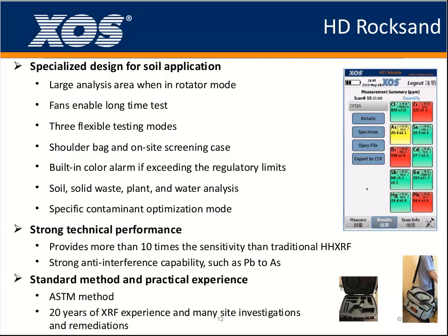Because different areas may have different regulatory limits, some operators are not well educated, or there are too many regulations. They cannot remember the concentration limits of all the elements for all the regulations. So this function can help the operator distinguish whether their samples are exceeding the limit numbers.